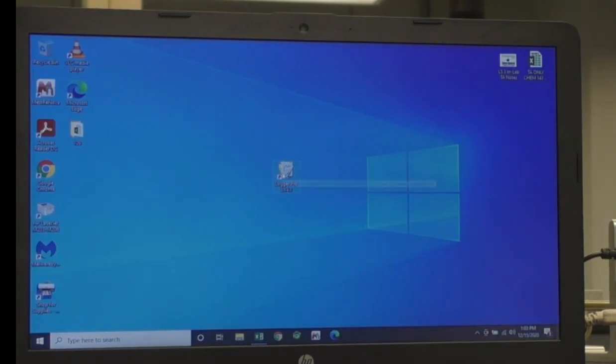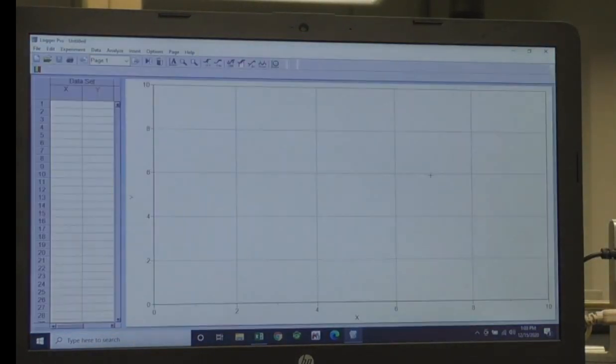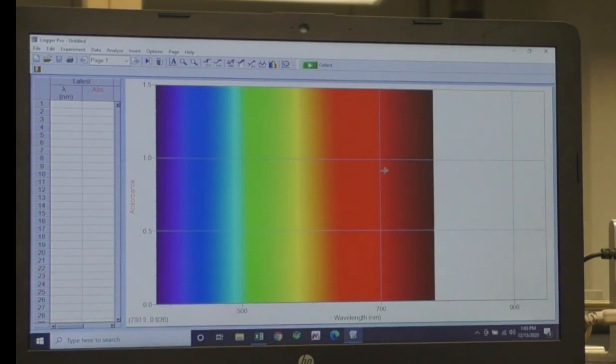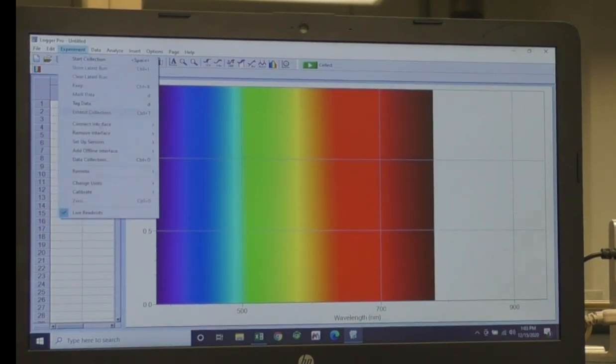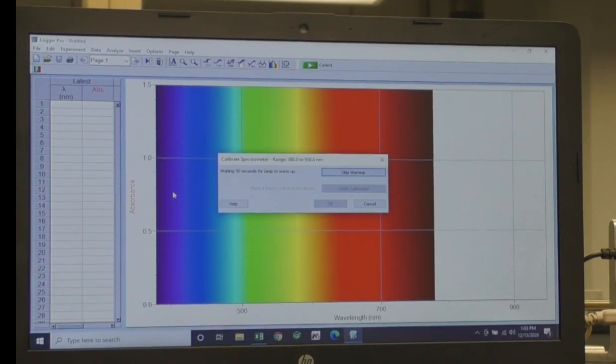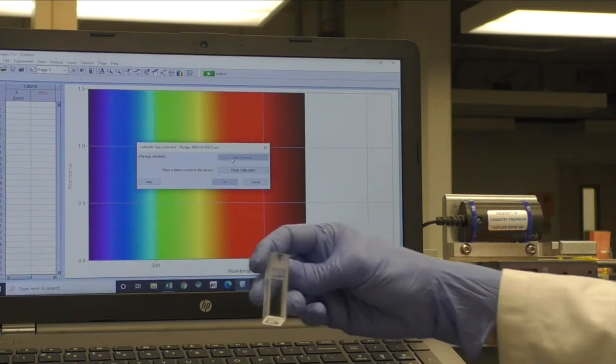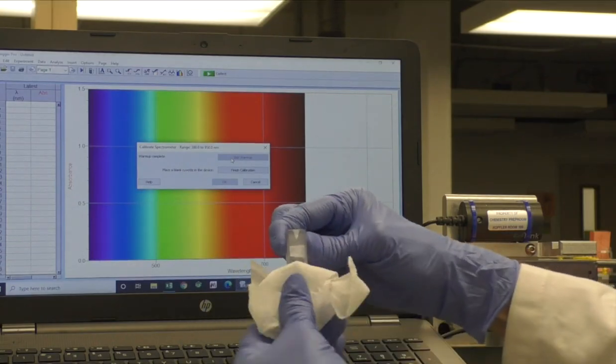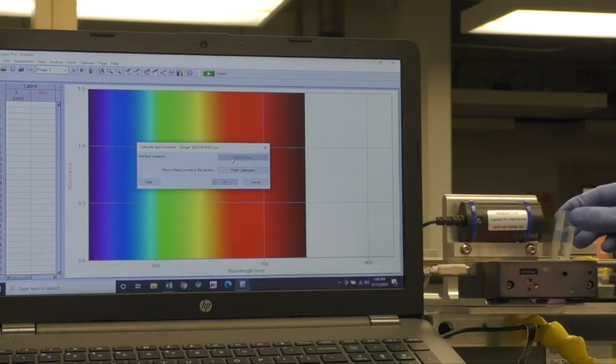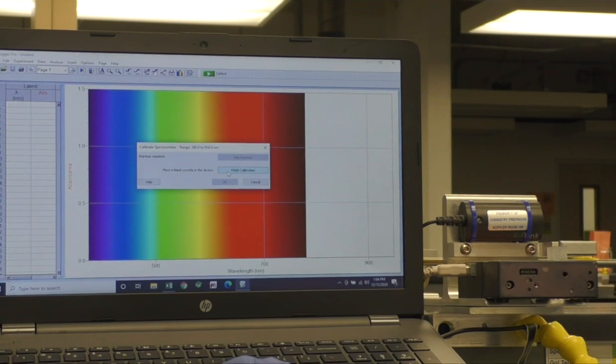Plug the spectrometer into your computer and open LoggerPro. A rainbow background will appear. Choose Experiment > Calibrate > Spectrometer 1. In the dialog box, you can click Skip Warm-up if the spectrometer has been on for 90 seconds. Using the cuvette with your solvent, wipe it with a Kimwipe and place it in the spectrometer. Click Finish Calibration, wait until it is done, and then choose OK.